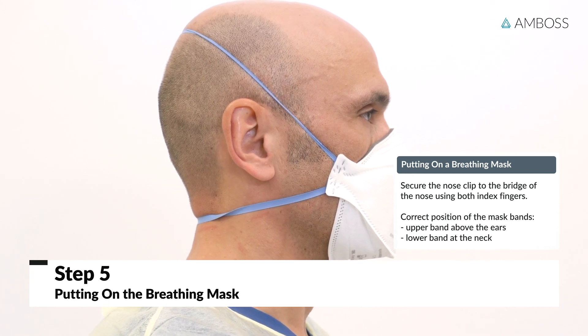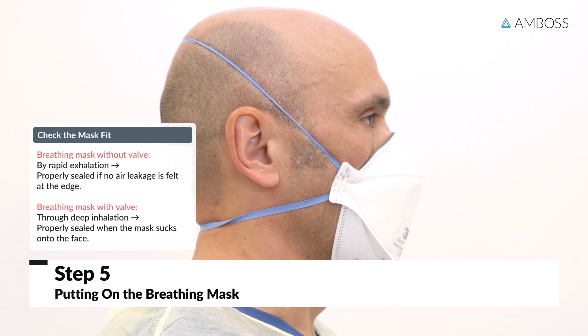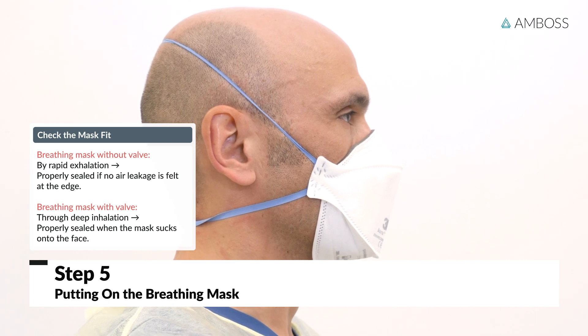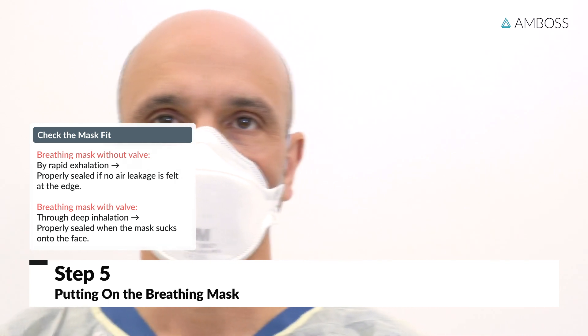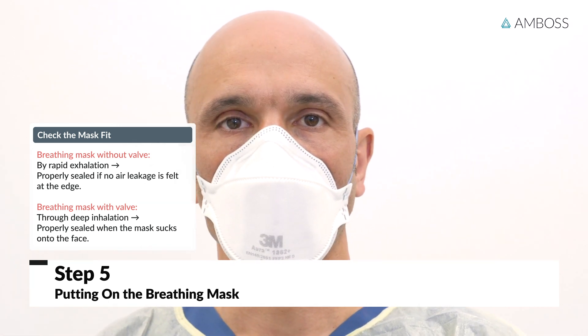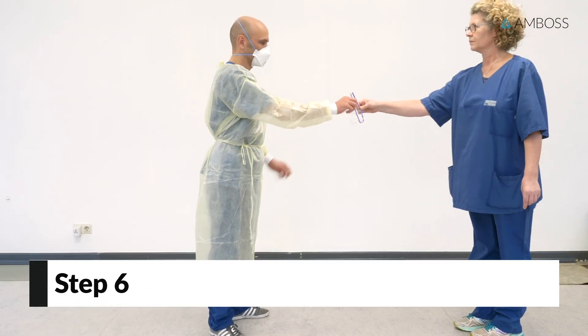Now check whether the breathing mask is fitted tightly. In the case of a mask without a valve, exhale quickly to check the fit. The mask is correctly fitted if there is no air leakage at the edge of the mask. To check the fit of a mask with a valve, inhale deeply. If the mask fits correctly, it will collapse somewhat against your face.